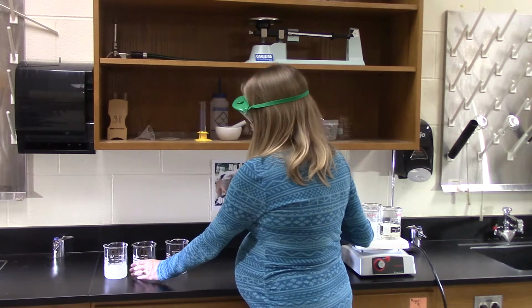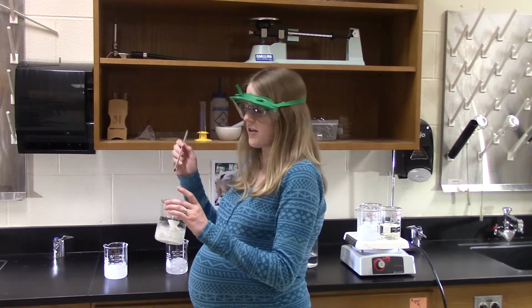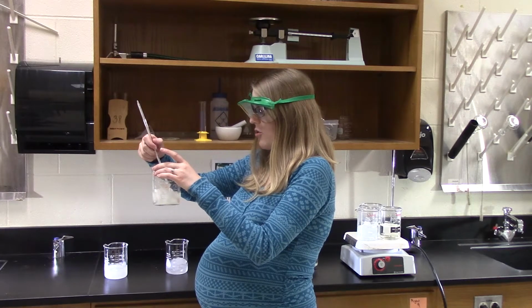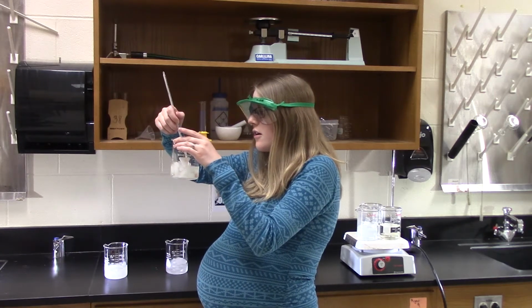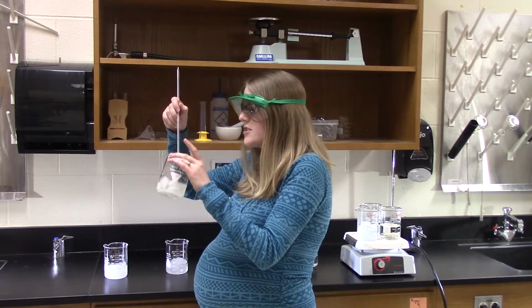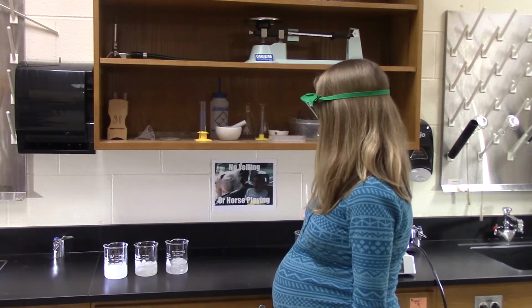Now, if you remember, when we add a solute, it lowers the melting point. So we should be seeing something lower than 3. Let's go ahead and see what we're looking at right here, something lower than 3. Because there is a solute in here, so it should get down to lower than 3. Yep, we're looking at 1 degree. Typically when I do this demo, I like to see it under 0. So it's a little higher than what I like to see normally, but that's okay, it's called science.